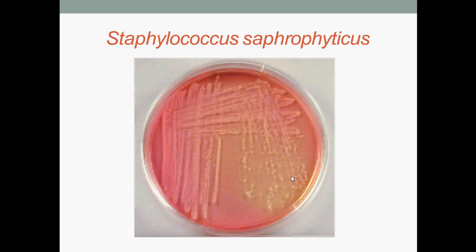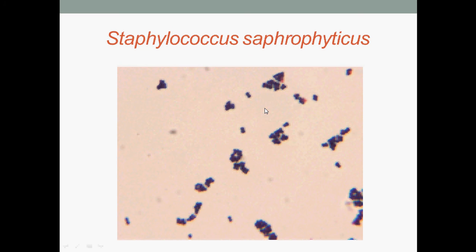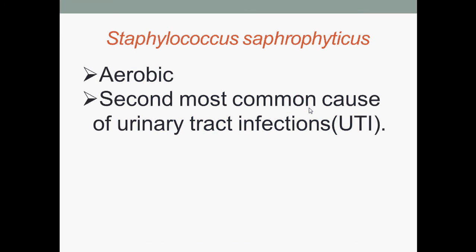Here we have Staphylococcus saprophyticus growing on mannitol salt agar. Staphylococcus saprophyticus under microscopic view. Staphylococcus saprophyticus are aerobic. They are the second most common cause of urinary tract infections, UTI.